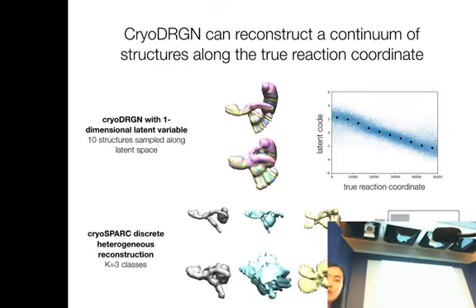In contrast, CryoSPARC, which is an existing tool for traditional cryo reconstruction, its multi-class reconstruction with 3 classes is only able to reconstruct 1, maybe 2 volumes that resemble the ground truth, with a third having very weird alignment artifacts. And in general, you also lose the underlying heterogeneity in the data.